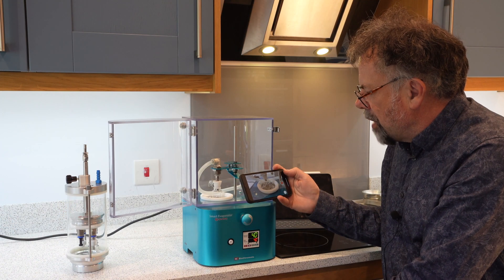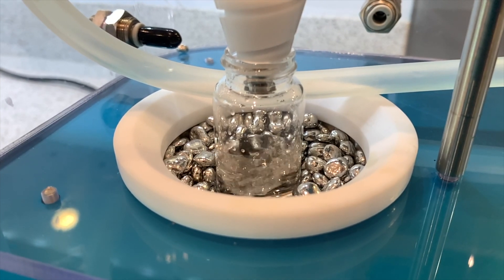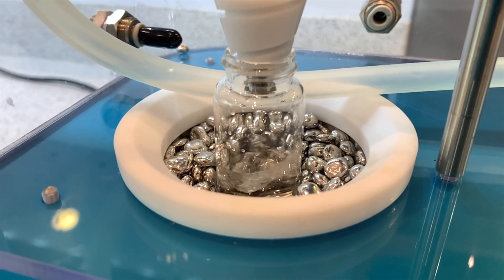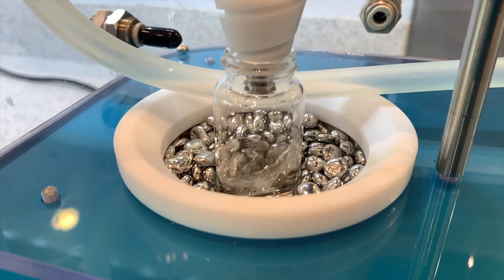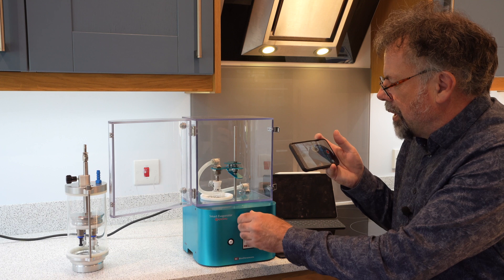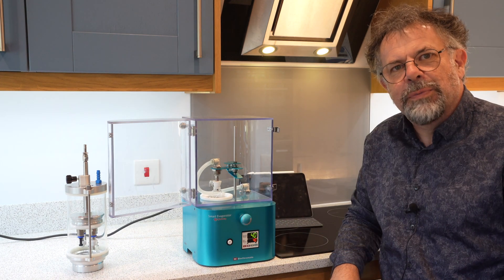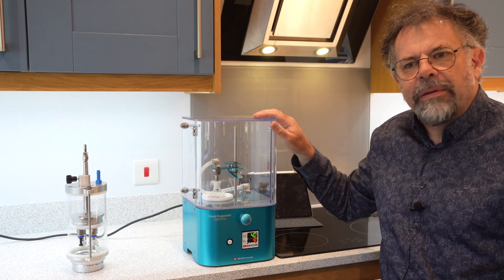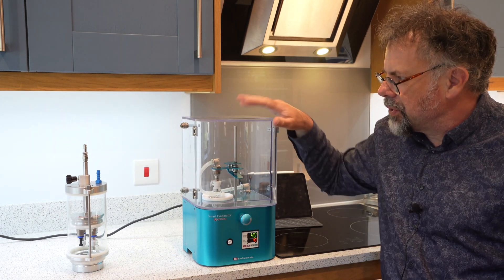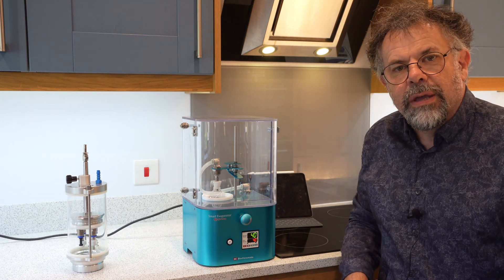I'm also showing a slow motion version. The Smart Evaporator is a very simple and very safe tool to use with its closure door, and it doesn't take up a lot of footprint in the fume hood.